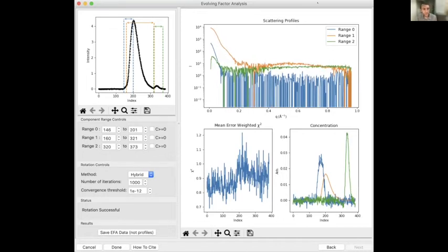And when we're done, we can go ahead and save those profiles for further analysis. Actually, this technique was absolutely essential for us to isolate that scattering from the tetramer. Although in retrospect, we could have just used a better column, I think. Okay, so let's dive back in.